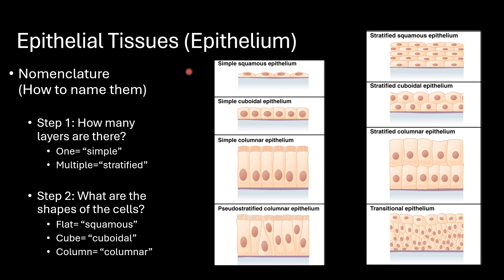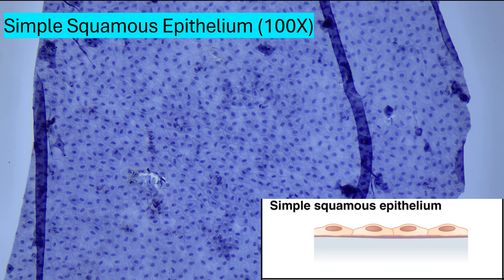Let's look at simple squamous epithelium. Here we are looking at a tissue sample at 100 power — magnified 100 times normal vision. When looking at these slides, they've been prepared with stains to enhance the color. Usually a 3D sample is cut with a microtome to produce a thin sample. This sample is mostly for demonstration purposes; here we are looking at a top-down view — the tissue layer of simple squamous epithelium has been peeled away from the basement membrane. Let's zoom in to 400 power.